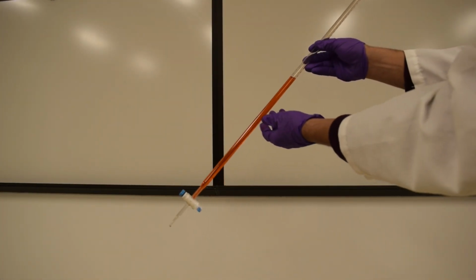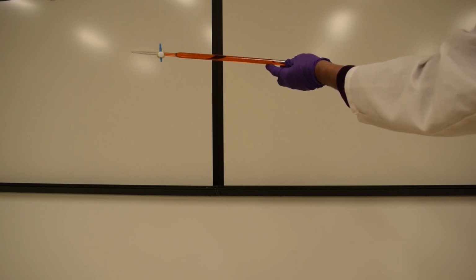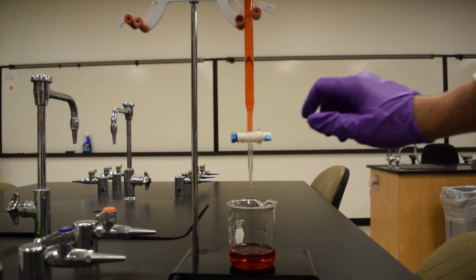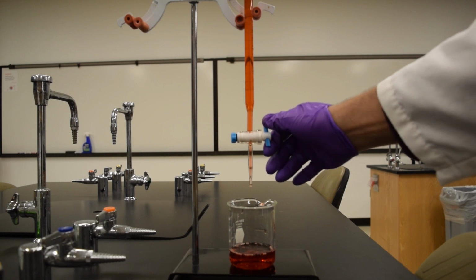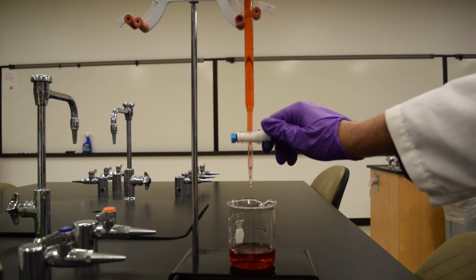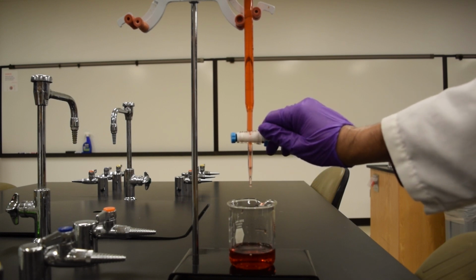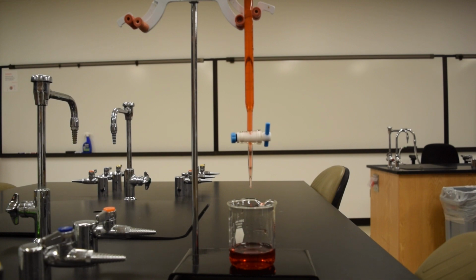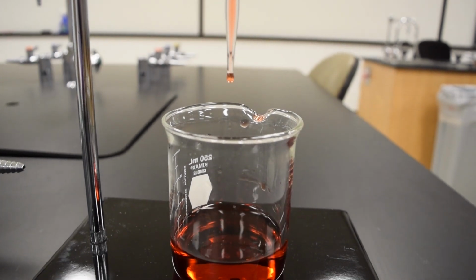As I mentioned earlier, tilt and rotate the buret so the solution touches the inside of the glass. This will clean the glass. Then, open the buret by rotating the stopcock. In some experiments, you'll need to adjust the flow rate by adjusting the stopcock. This will give you accurate readings. Now, let's go to the data collection for the buret.